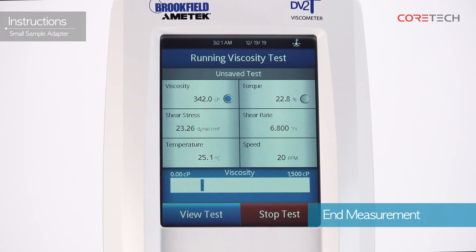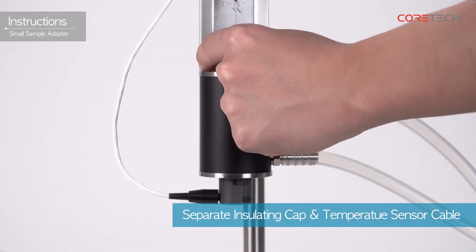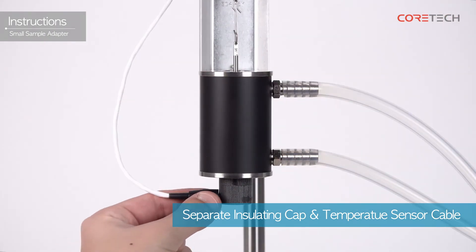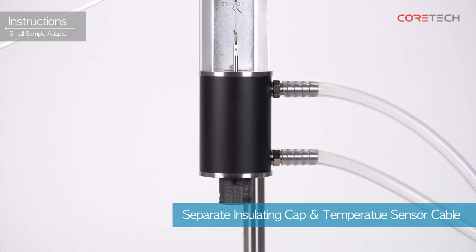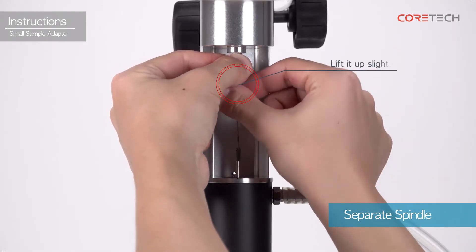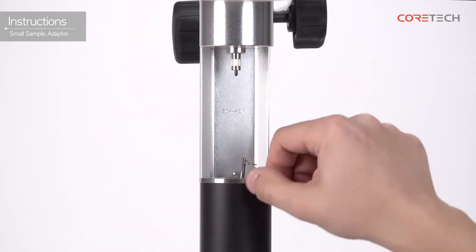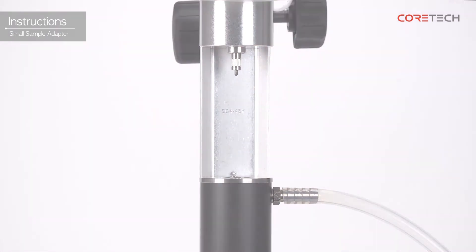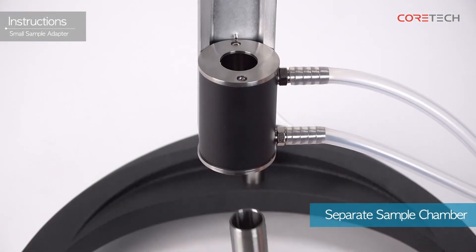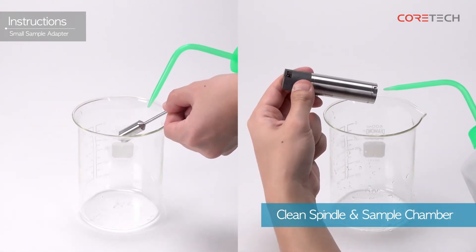Touch the Stop Test button to end the measurement. When the measurement is complete, remove the insulation cap, then disconnect the temperature sensor connection cable. Remove the spindle — when removing the spindle, hold the coupling screw upwards. Remove the sample chamber, then clean the separated spindle and sample chamber sufficiently.